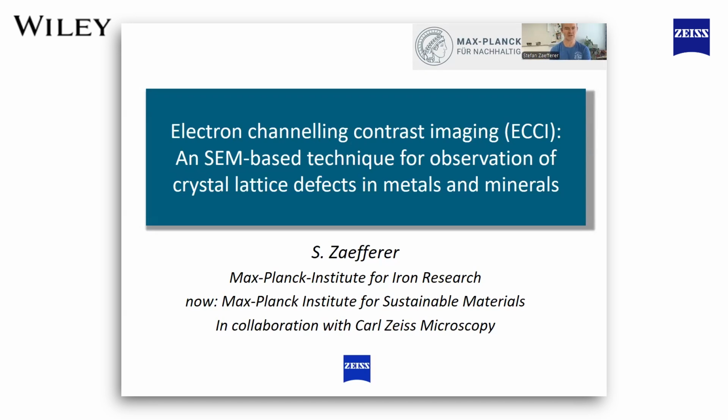I will introduce the technique electron channeling contrast imaging, shortly ECCI, which is an SEM-based technique for the observation of crystal lattice defects. That means, for example, dislocations, stacking faults, grain boundaries, and so on, in metals, in minerals, and in other crystalline materials.